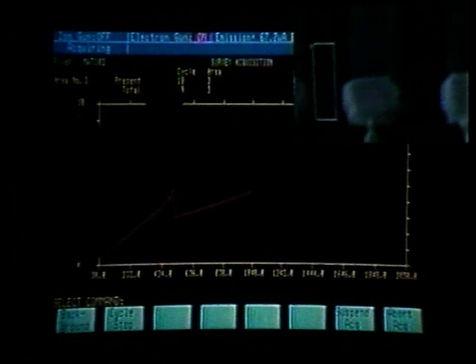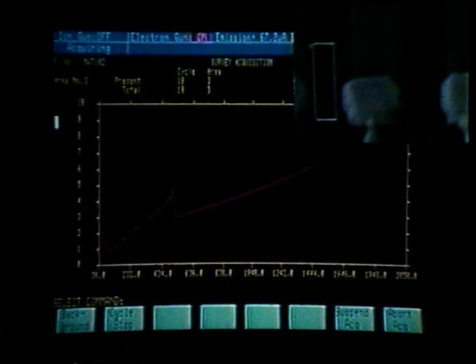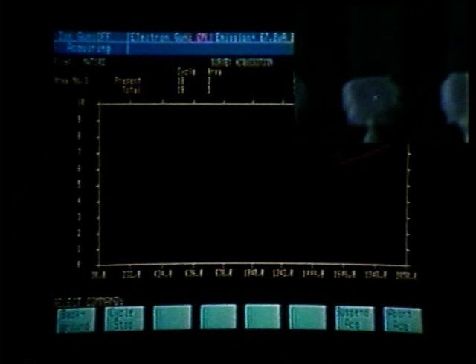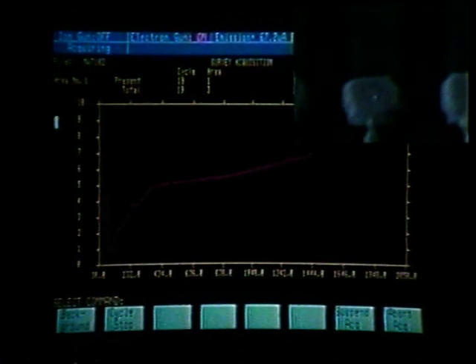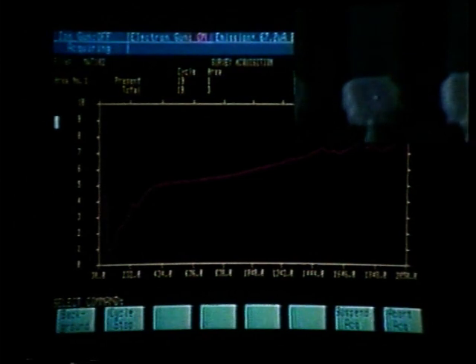At this point, just about 30 minutes has elapsed. We see that we are presently on cycle number 18 out of 19 cycles, monitoring area 3 as shown both on the graph and on the TV image. We are now beginning our final cycle. We are on area number 3 and cycle number 19.